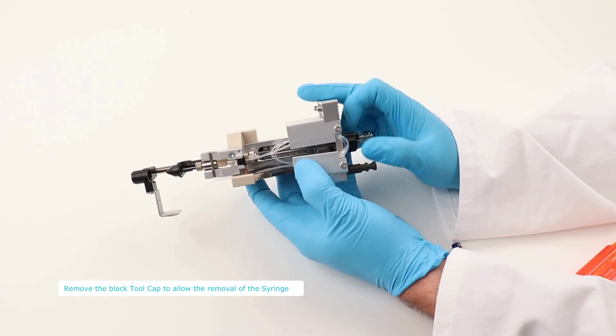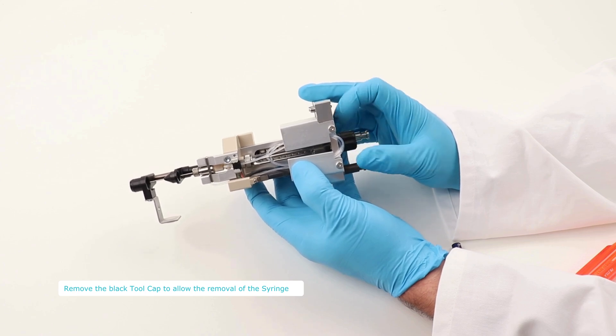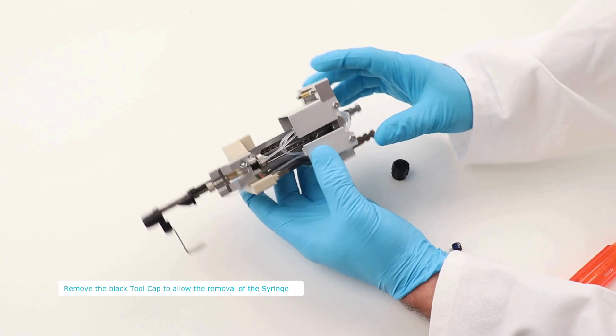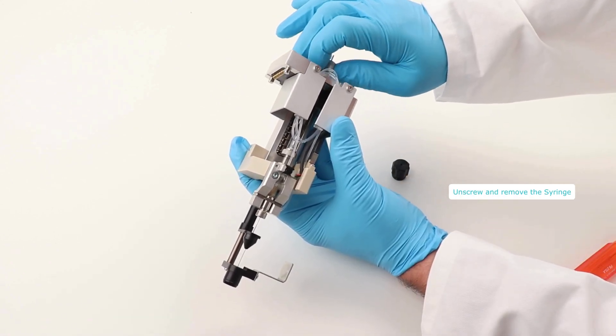Proceed to remove the black LC-MS cap to facilitate the removal of the syringe. Unscrew the entire syringe and gently extract it from the tool.